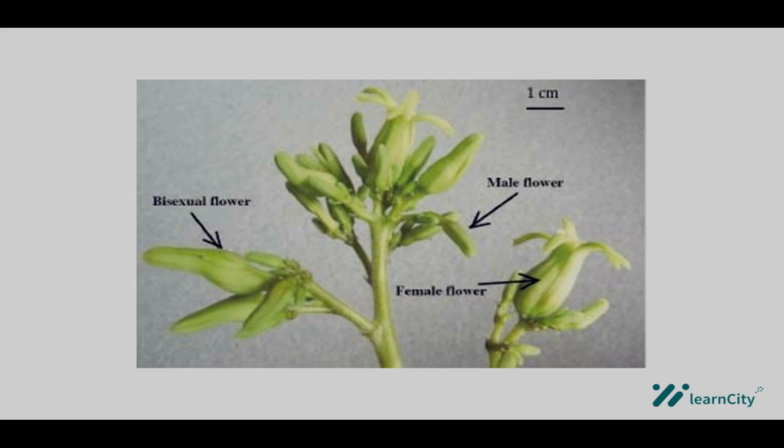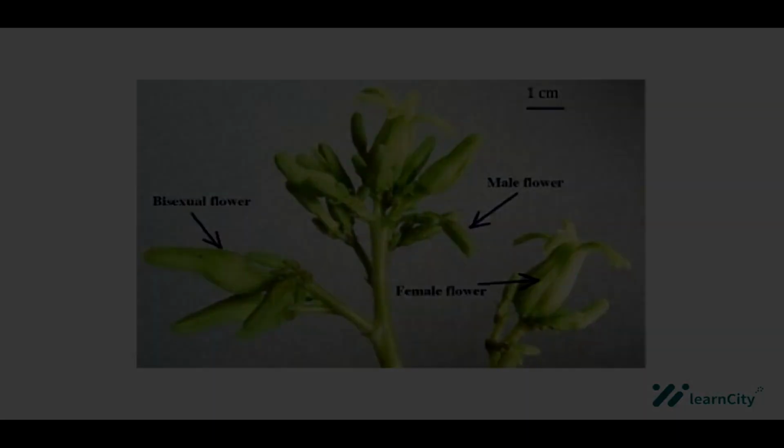We have a tree for the male flowers, and we have a tree for the female flowers. However, we have some times where the female tree bears male flowers also. So we could have some situations where the female tree also bears male flowers.